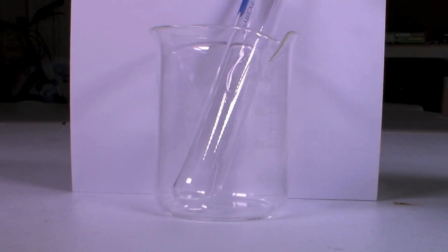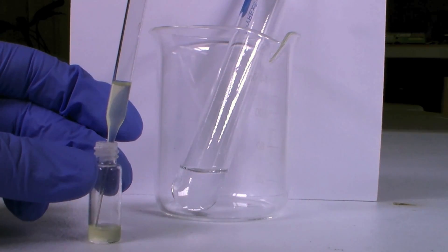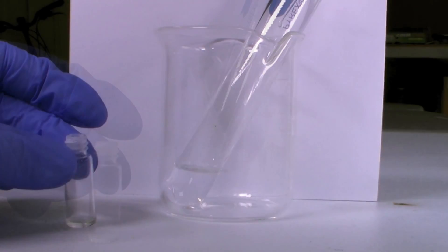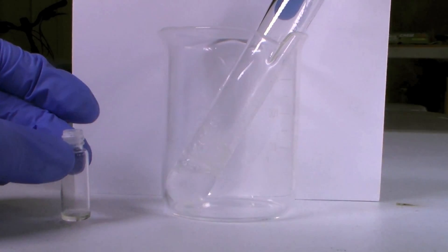I first add a couple milliliters of water to a test tube and then I use a pipette to add the silicon tetrachloride to the test tube. You can see the yellow color quickly disappearing as the silicon tetrachloride is destroyed by the water.